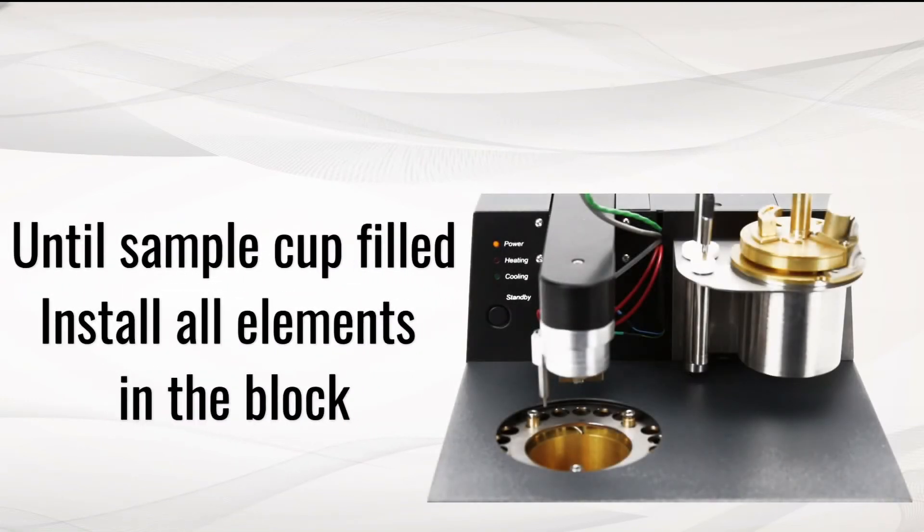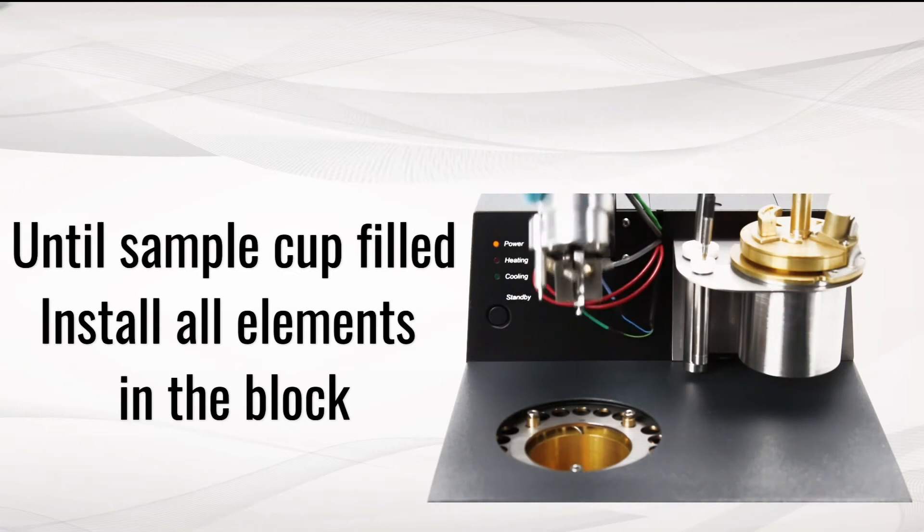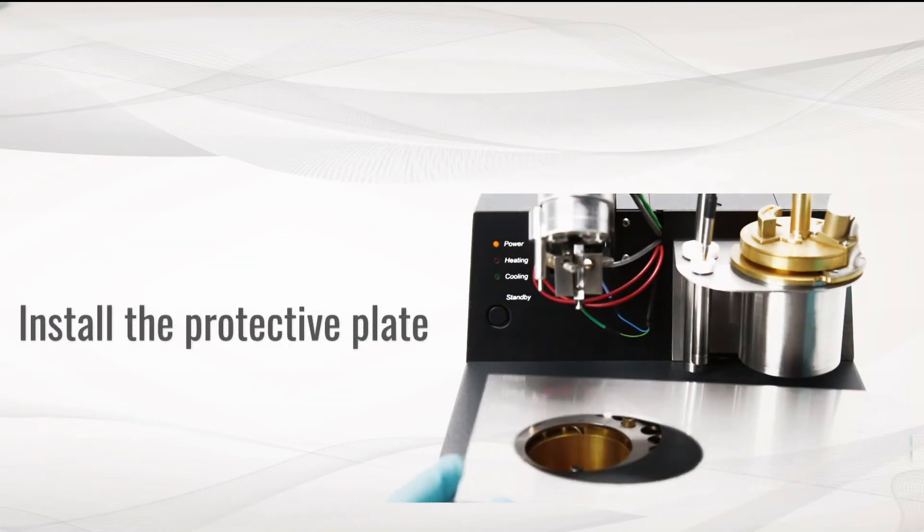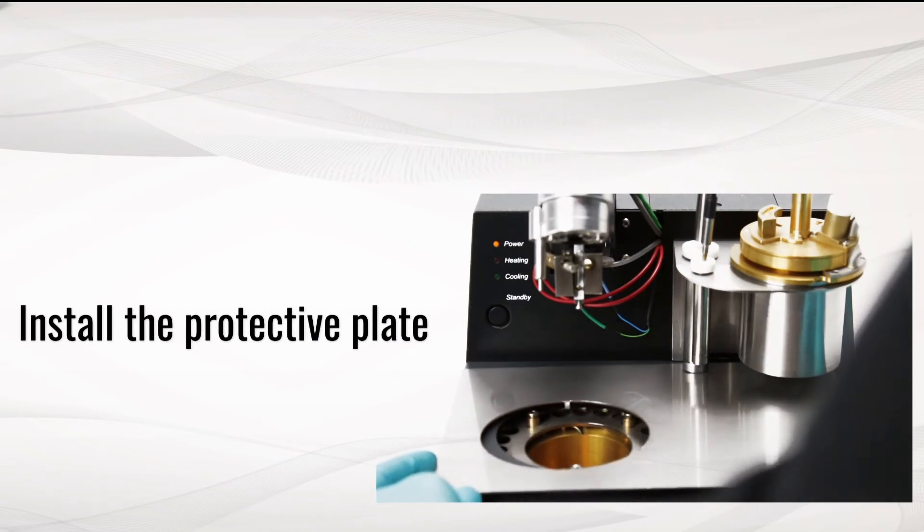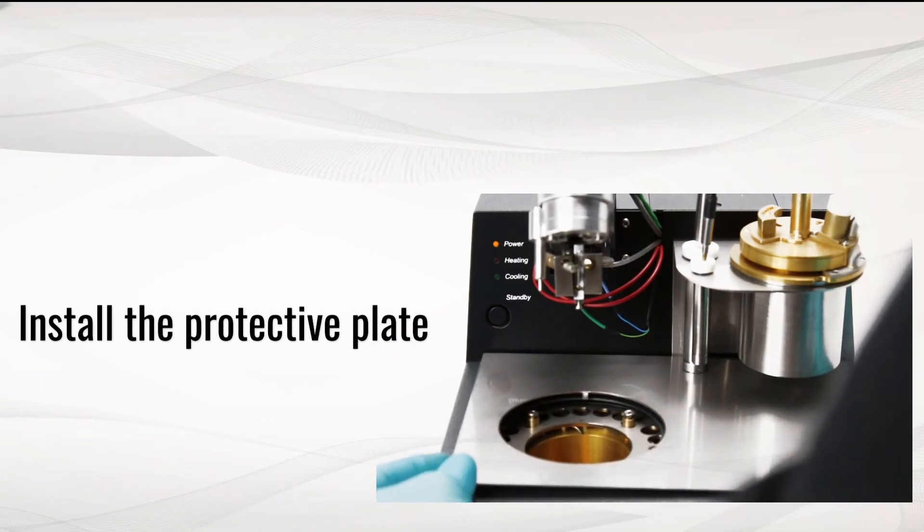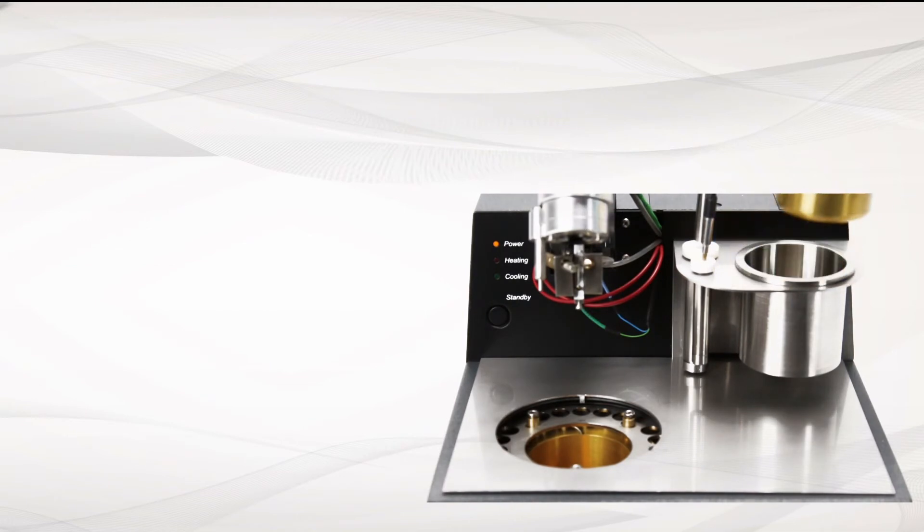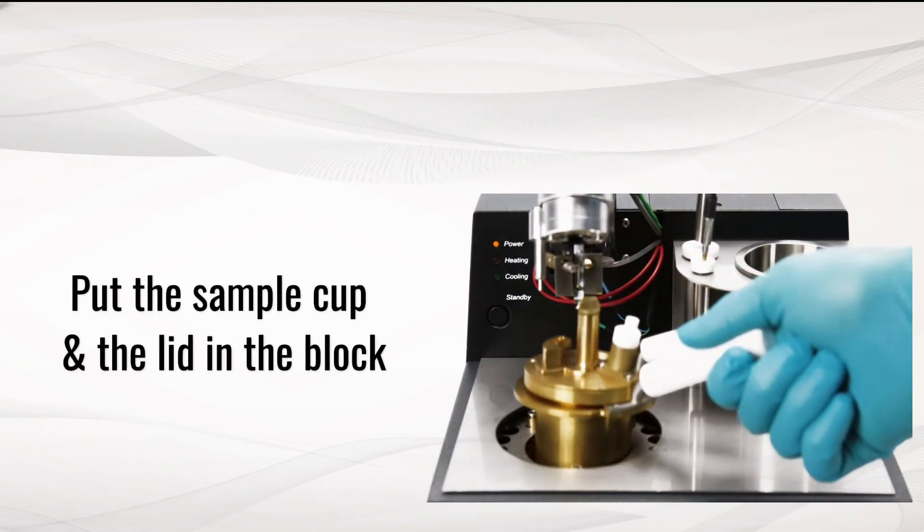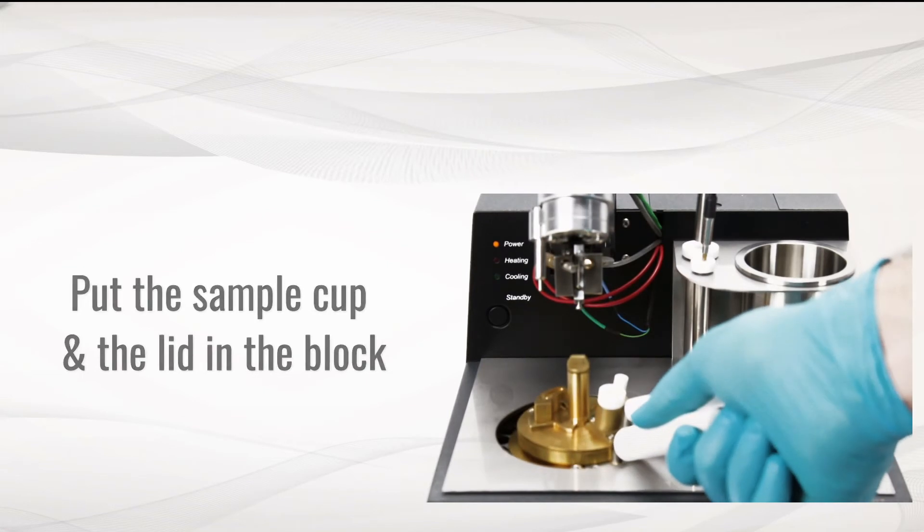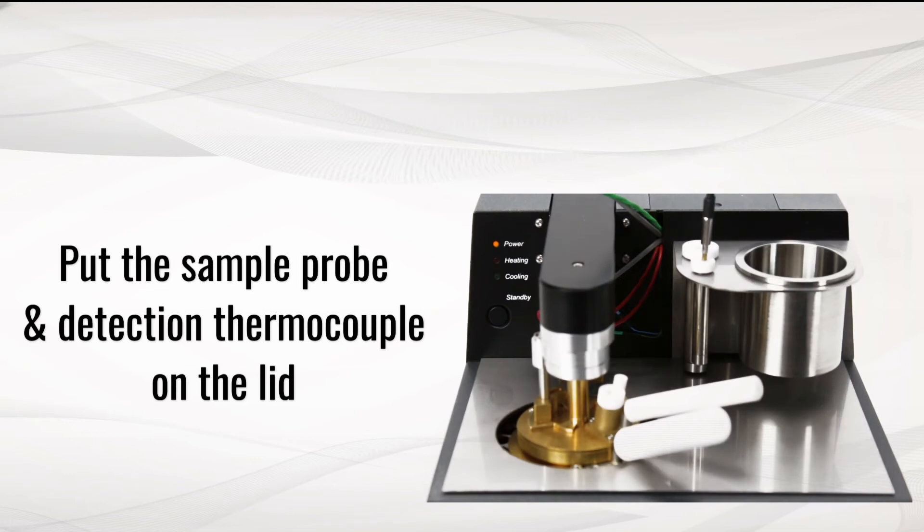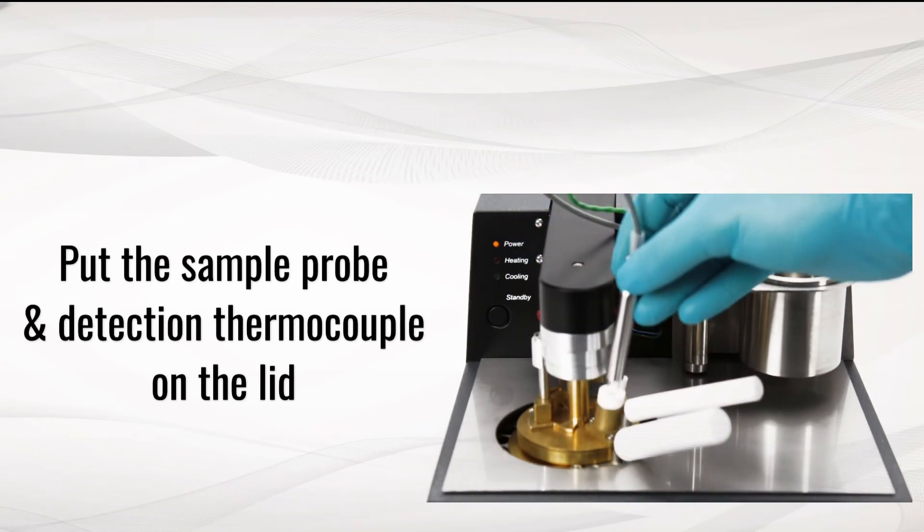Fill the cup with the sample to be tested. Install all elements in the block. Install the protective panel. Install cup and lid on the holder. Lower the arm on the lid. Put the sample probe and detection thermocouple on the lid.